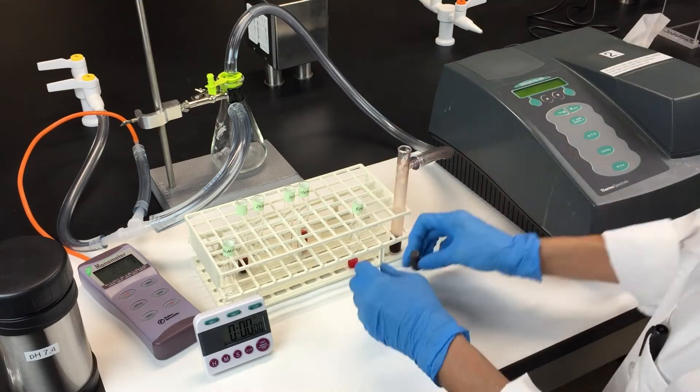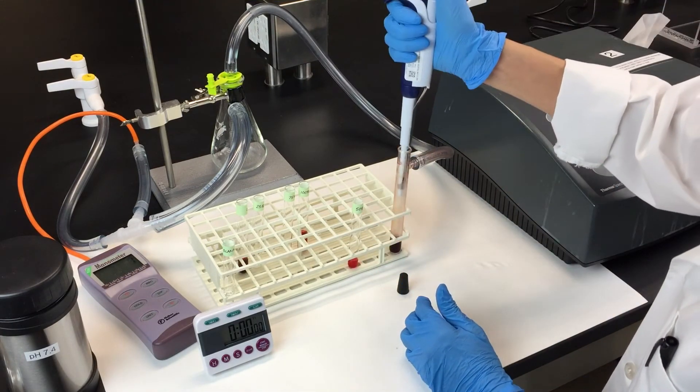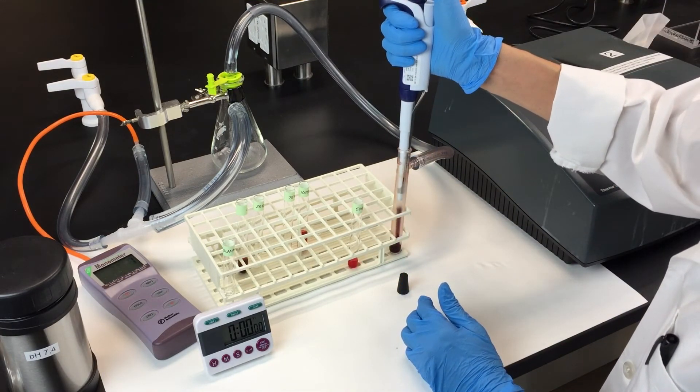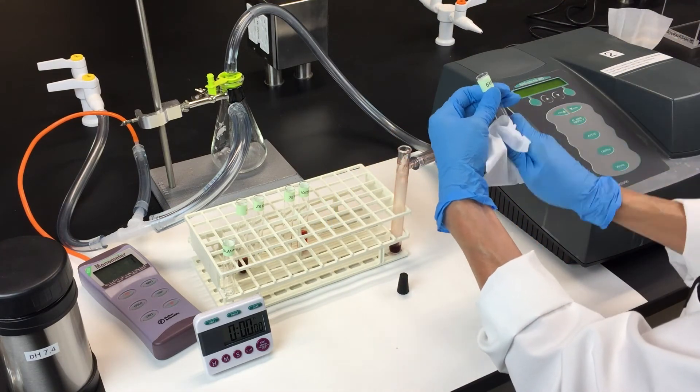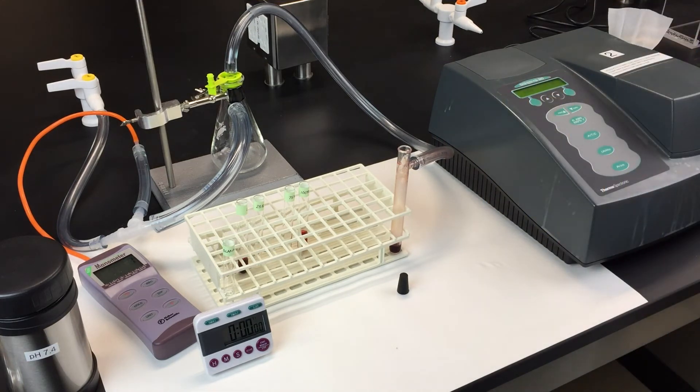Now add one milliliter of the fully deoxygenated hemolysate to the 50% oxygenation tube. Wipe off the tube, place it in the spectrophotometer, and take the reading.